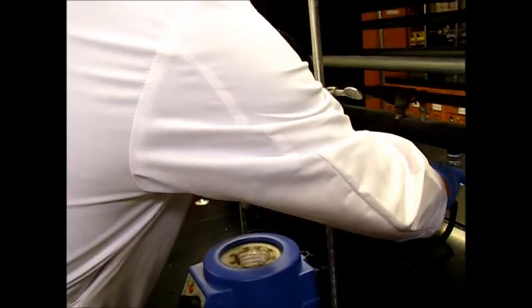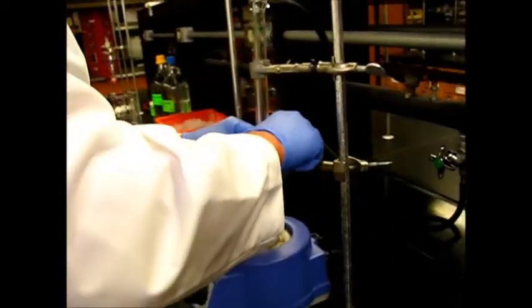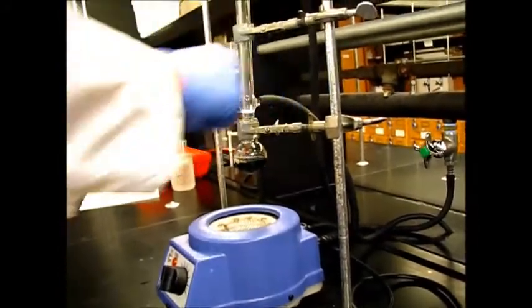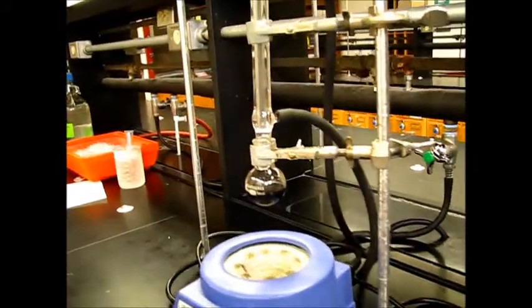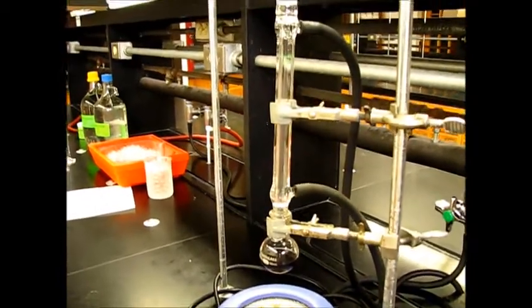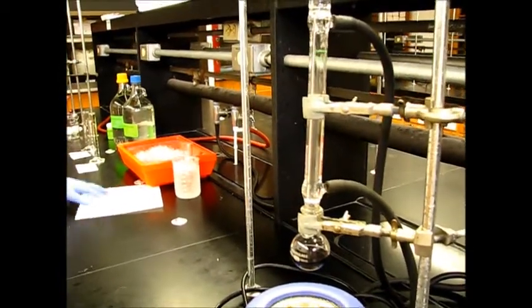Should make sure that they are all nicely clamped. Yes. Because right now, the round bottom flask is very hot. So we'll wait, let it come to room temperature, then we will remove it.